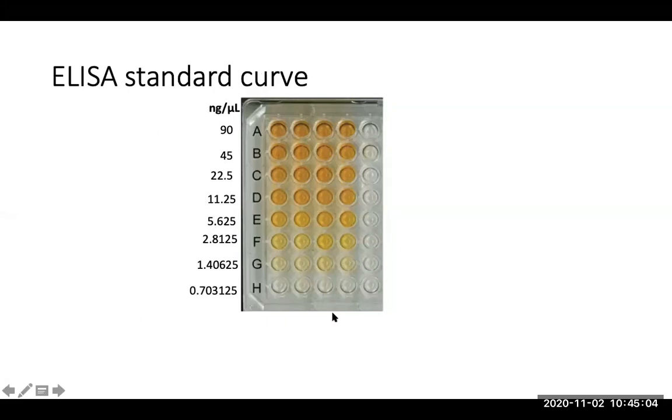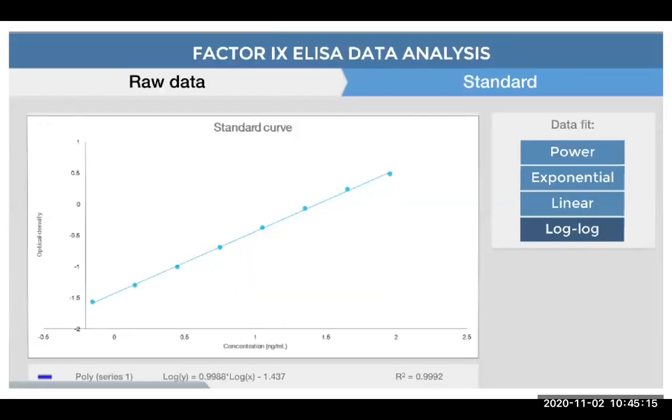All right, so once you have the standard curve set up correctly like this, how is it used to estimate the concentration of an unknown sample? In order to do this, you have to graph the color versus the concentration. And so here you can see the graph that might be made from plotting the color measured as optical density versus the concentration. Generally, this kind of curve is expressed as a log. That means that this is log and this is log.